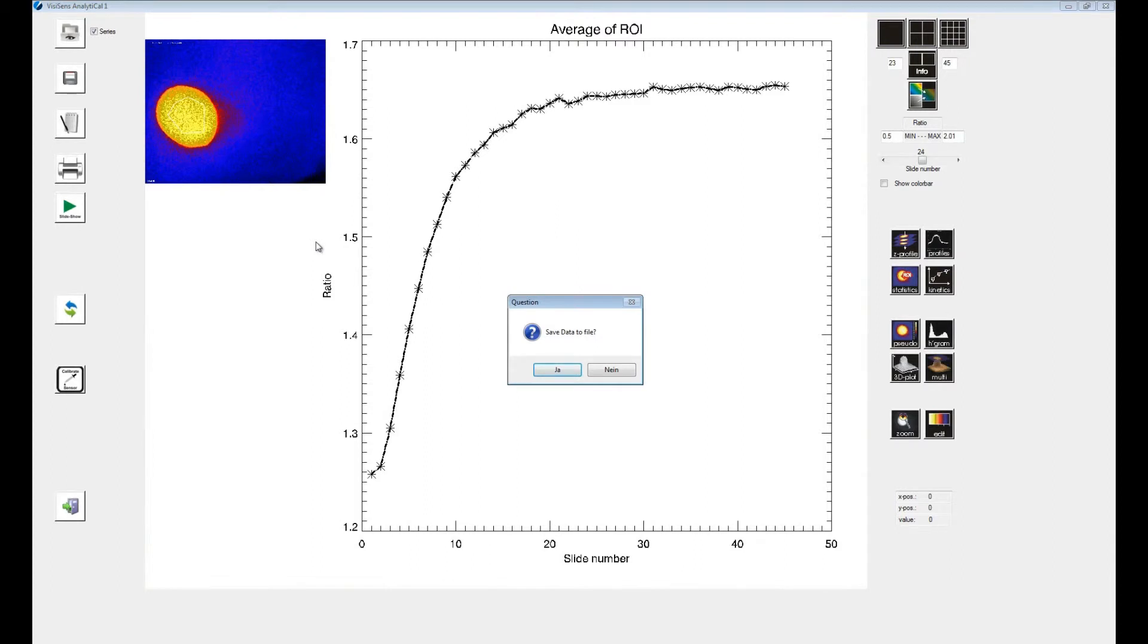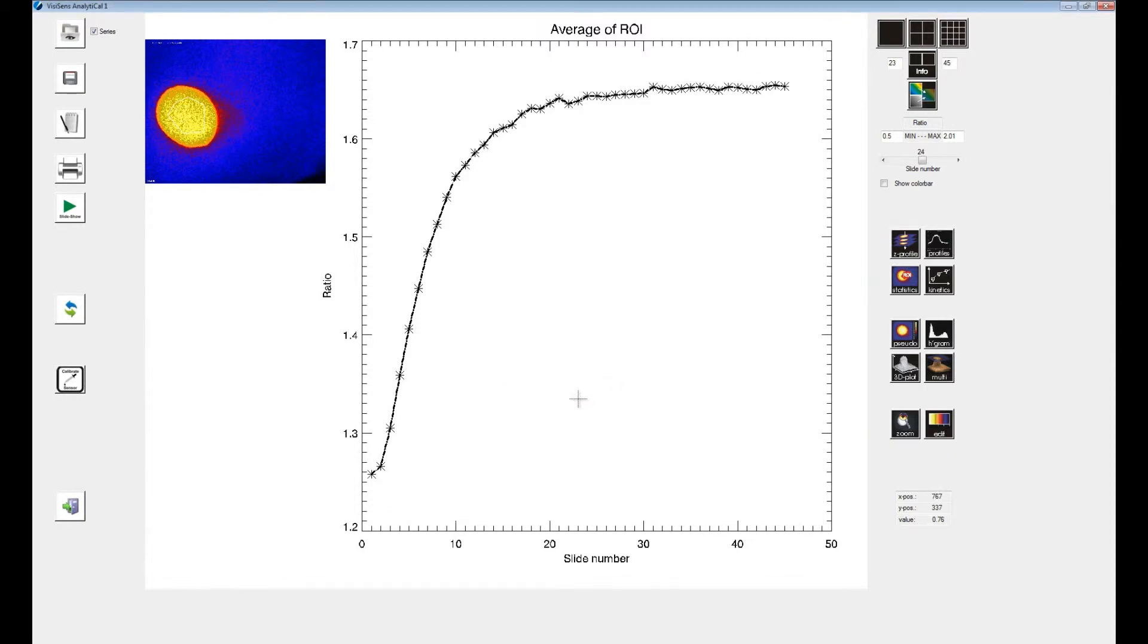You can save this data if you want to. The software has calculated average values in the ROI for all images and displays the respective graph.